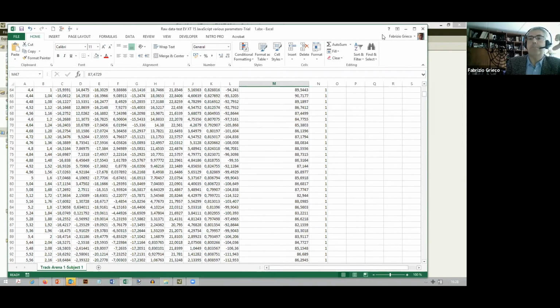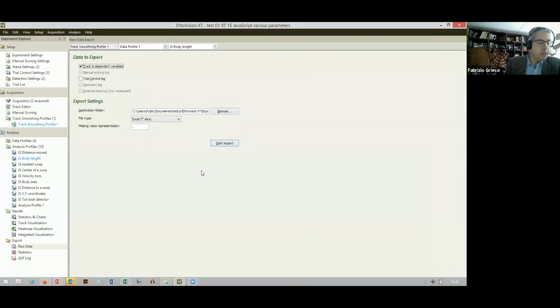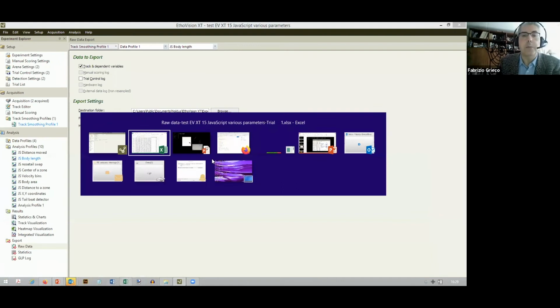Right. I'm going to close this. And let's see. Let's go back to the examples.